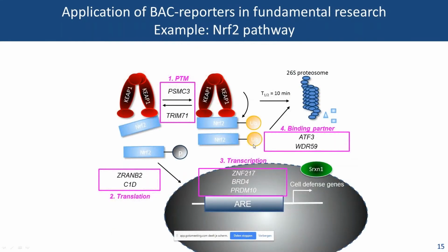And right now we are involved in, so then we also performed a deconvolution screen. So first we screened the SMARTpool, so a combination of 4 small interfering RNA sequences targeting the same gene. And right now we also performed deconvolution screens, so screened also the single RNAs to really validate some of these genes. In total, we validated in this case dozens of different genes.